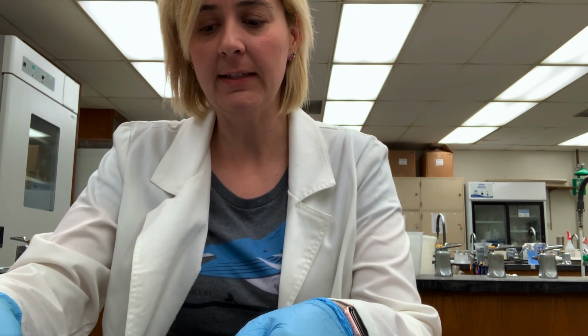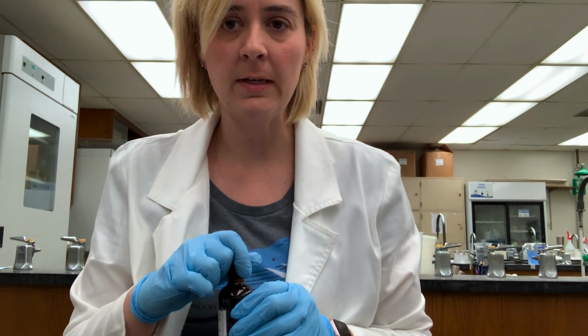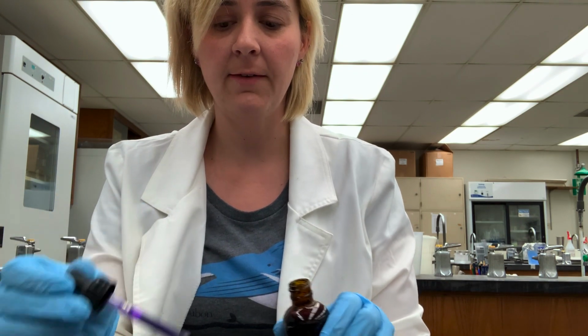Okay, so our Gram stain slide has air dried, and so what we'll do now is do a little heat fixation. So remember, gently pass through the flame. Okay. And the first step in a Gram stain is to stain all of the cells using a direct stain. And the direct stain that we use in a Gram stain is Crystal Violet. So I'm going to cover all of my smears with Crystal Violet. And we'll allow that Crystal Violet to sit on the slide for 1 minute.